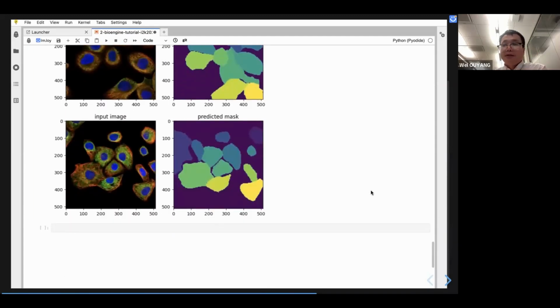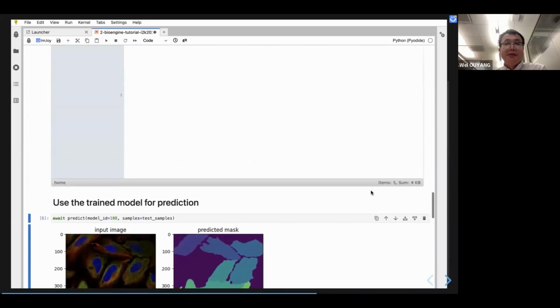Okay, so this is one demo. Any questions for this? There's some chat, huh? Oh, yeah. So let's look at some of the questions. Do we need to see some of the interesting ones?